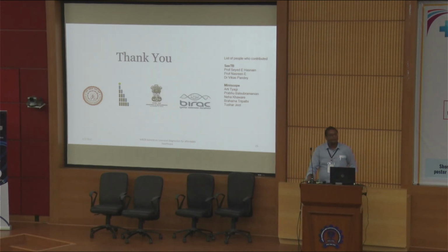Yeah, thank you, Professor Ravi. Actually, I wish to know about the sensitivity and specificity of your system, the microscope which you have developed, compared to sputum culture, which is the gold standard, and GeneXpert.